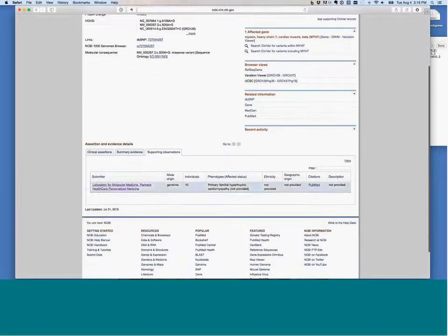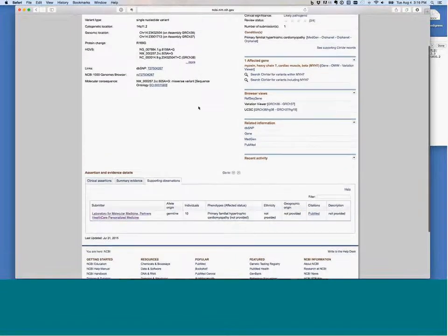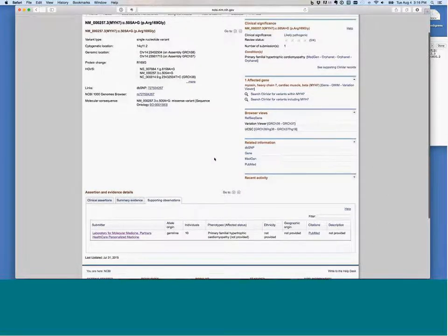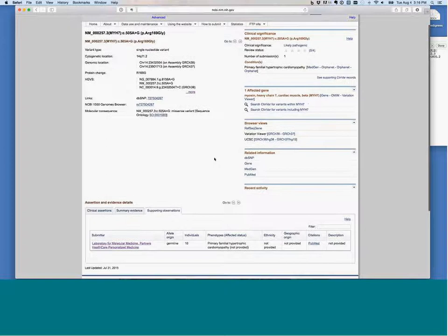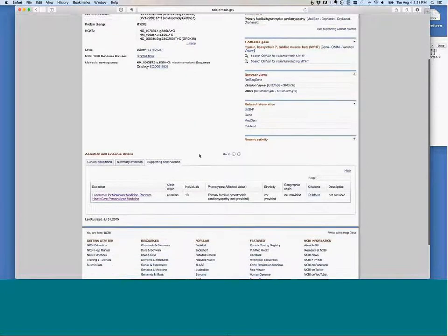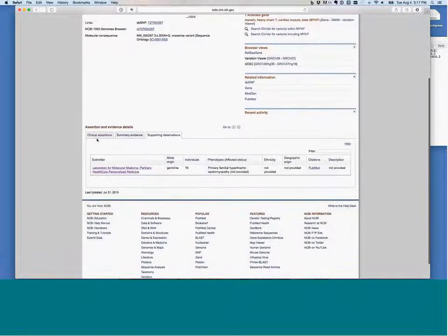I typically go down here and look at what data has been submitted and what assertions have been submitted by laboratories. There are a few other useful things as well. You can link to the Variation Viewer, to UCSC, to dbSNP, to the Thousand Genomes Browser. So there's a lot of different data and resources you can find from this entry.